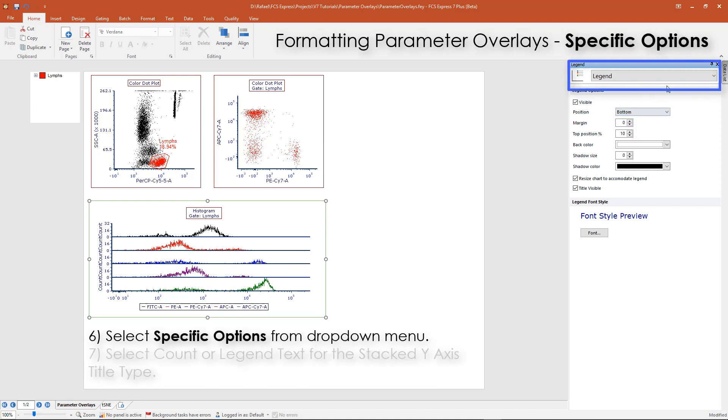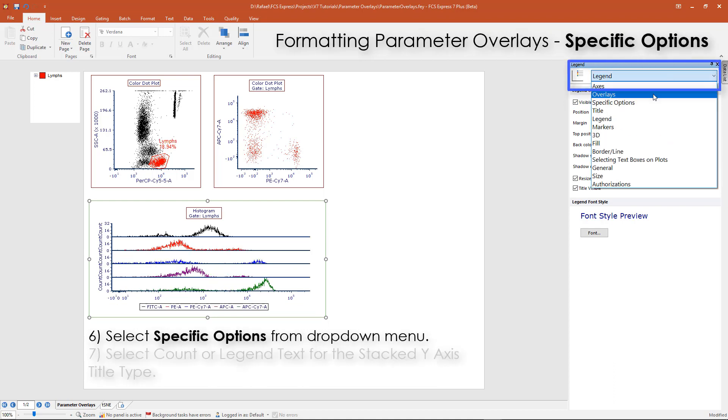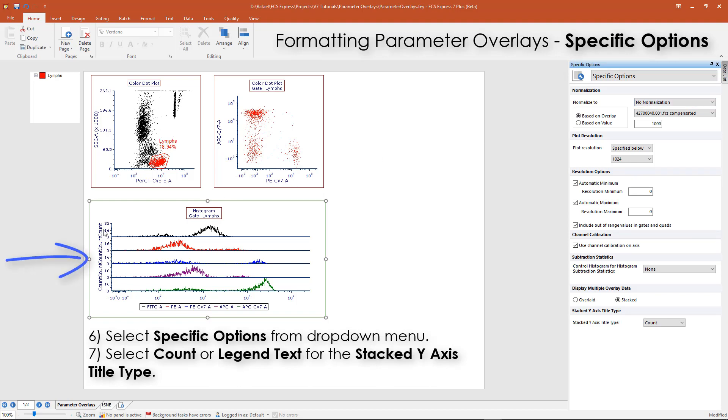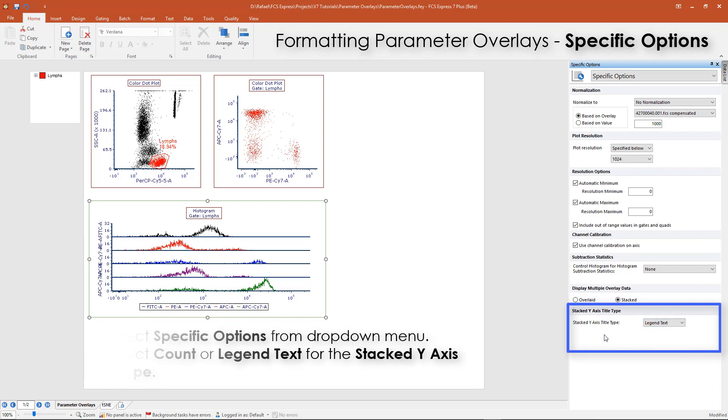From the Specific Options category, the Stacked Y-Axis title may be changed. You may choose to display the count or the legend text.